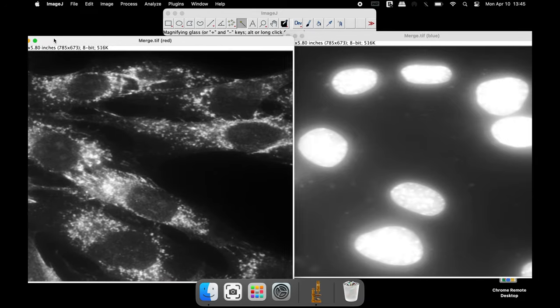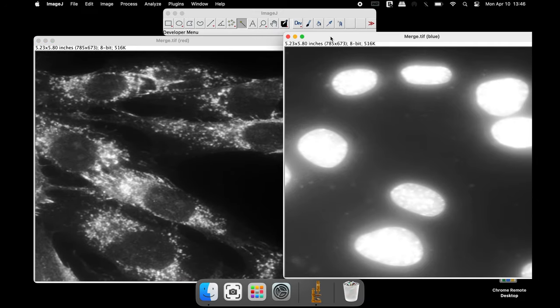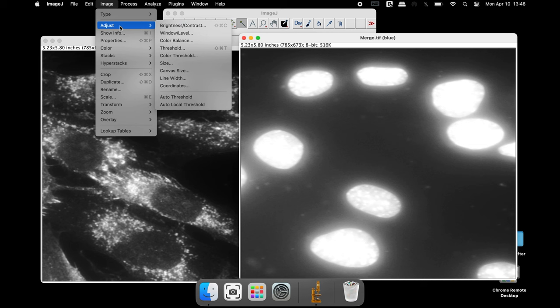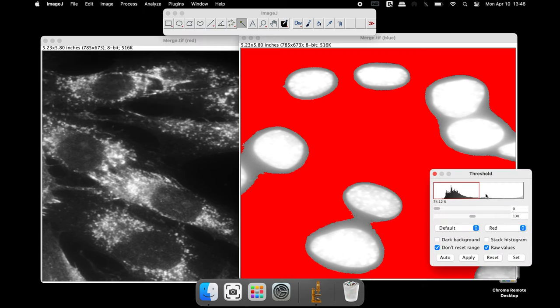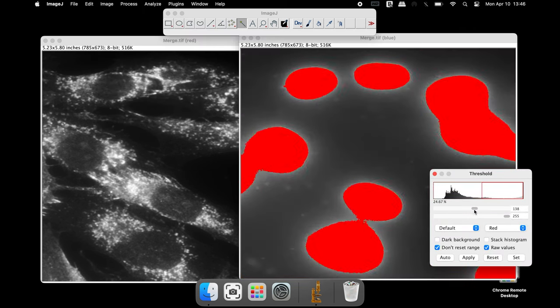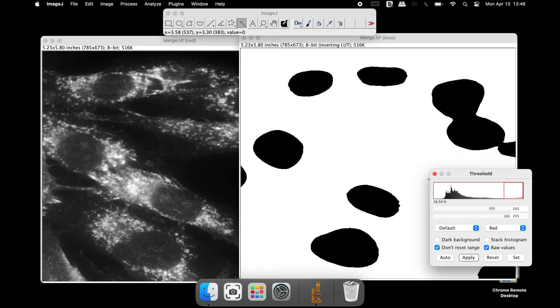Select the blue channel DAPI and adjust the threshold until all the nuclei are red in color with a black background. Once adjusted, select Apply.